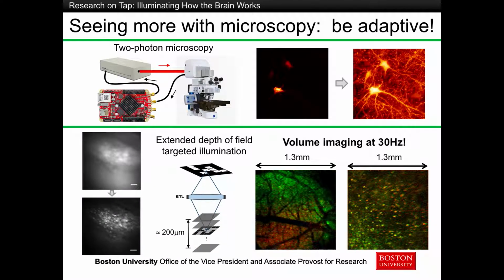What you could do is scan really fast with a very fast focus scanning mechanism, and it's faster than the camera. So in a single shot, you get all this information from the volume. But the problem is that in-focus information is swamped by out-of-focus contributions, by out-of-focus background. What can you do? You can adapt your microscope.